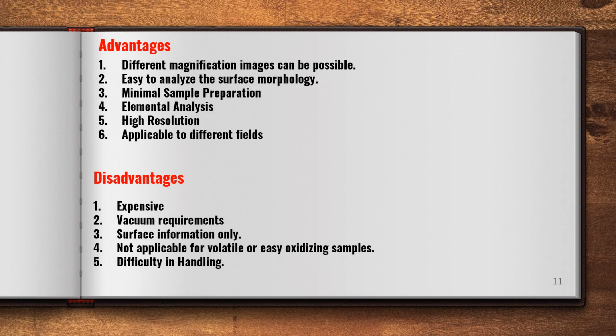And coming to how we can get the image. The secondary electron detector detects these electrons, and it will give the signal to the monitor. That conversion takes place in the form of an image. That image is used to characterize the nanostructures.